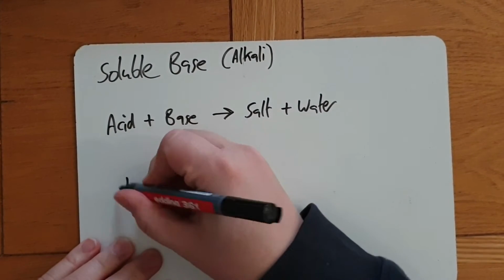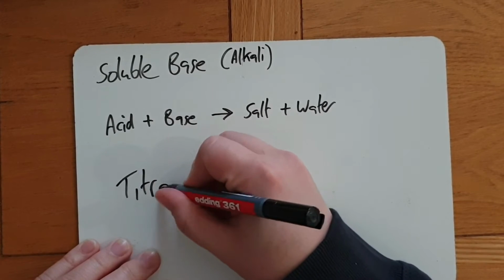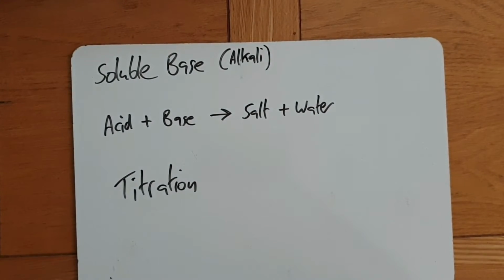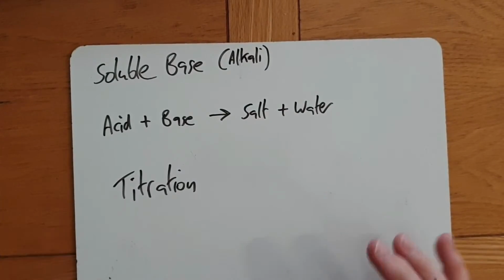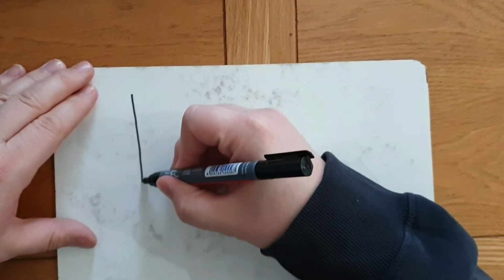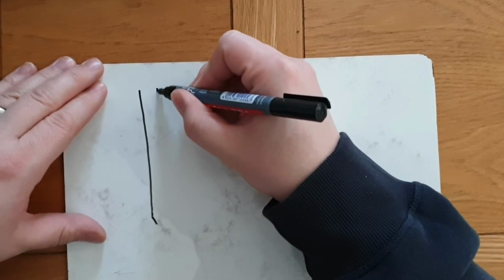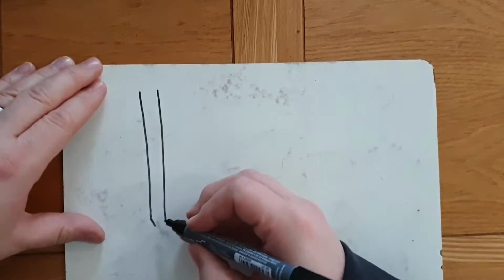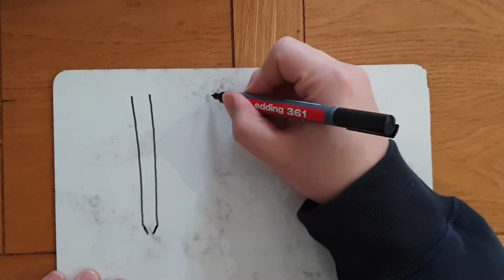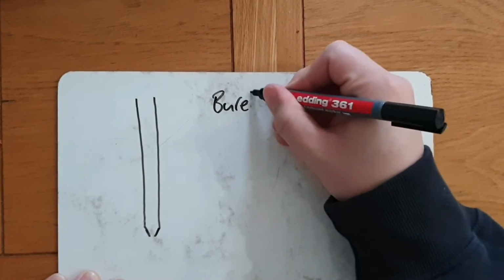And we do that by doing an experiment called a titration, and you measure them incredibly accurately. You have a piece of equipment, and I'll make sure that on the assignment I include some photos of this, or you can just go and Google it. There's a bit of equipment called a Buret. So here's a picture of an actual Buret I found online.